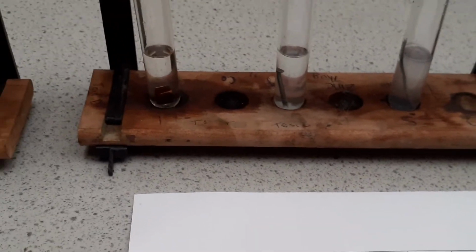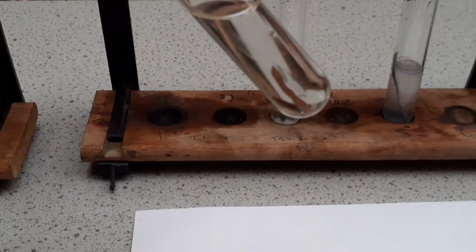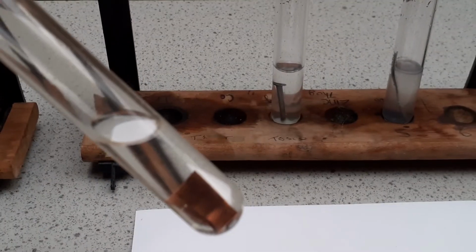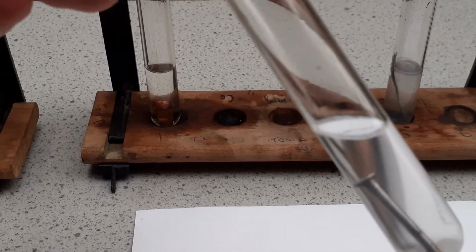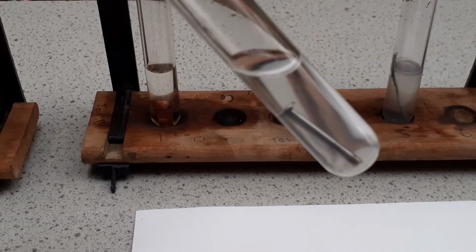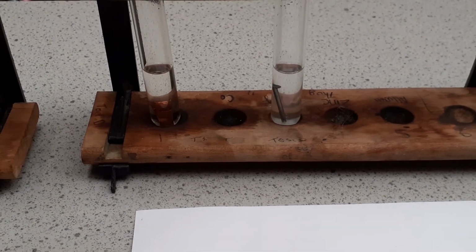Moving along to our solutions of zinc sulfate. As you can see, the copper is absolutely no change, so there's no reaction. We look at the iron, there's no change in the nail, so there's no reaction there. We look at the magnesium.